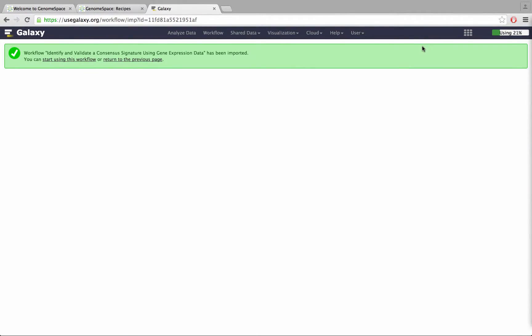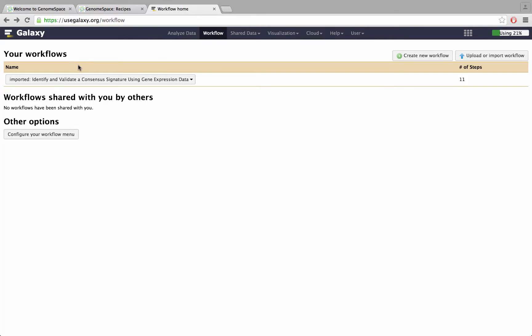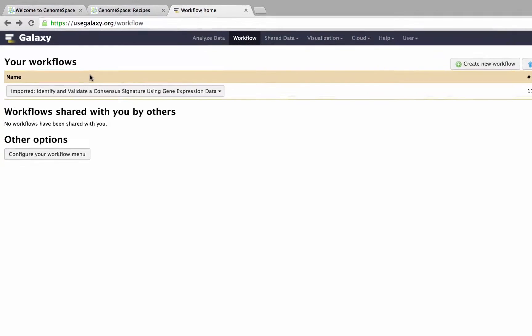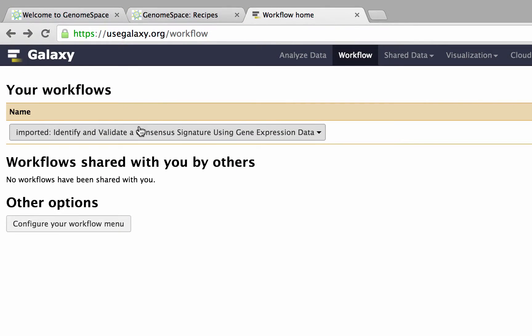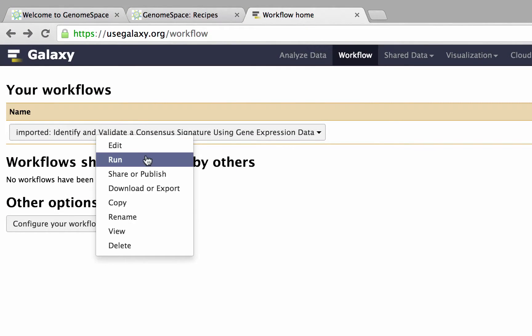To view your personal Galaxy workflows, click Use Workflow. The workflow should now appear in your personal list with the prefix Imported. Click the workflow, followed by Run to begin using it.